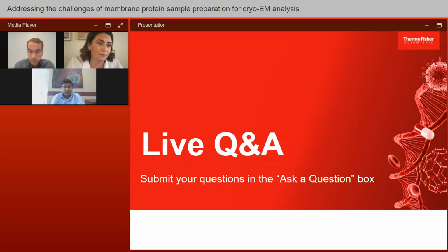Great. Still parsing apart this one question. The second part, I think, is to you, Mahfuz. Is the GPCR extraction and stabilization kit that you talked about applicable for other classes of membrane proteins? At first, we tested mainly on GPCRs, and later we tested other membrane proteins.